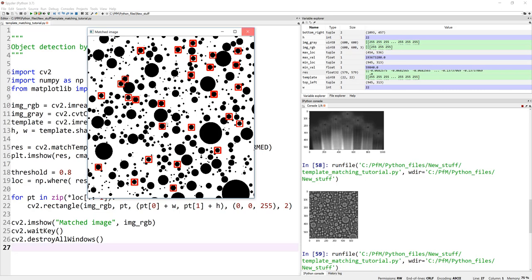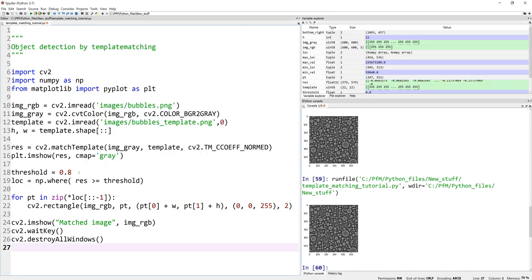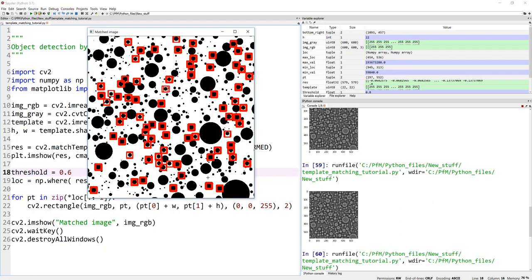You can, of course, change this to 0.76 or something, 0.6. And then hopefully we should see more of these bubbles. So there you go.